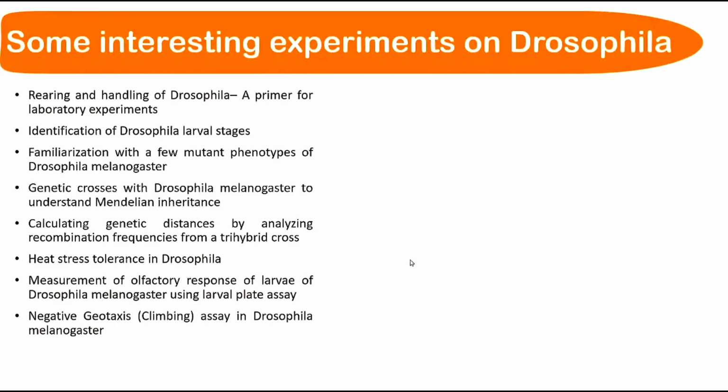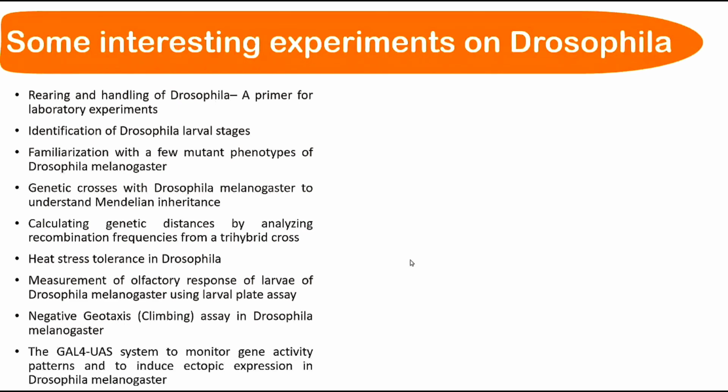It will take some time for them, right? So they are negatively geotaxic. Negatively geotaxic means they will move away from the floor, away from the gravity. But if you give them some harsh treatment, probably they'll take some time to get up and move again away from the ground. So you can perform similar such studies.